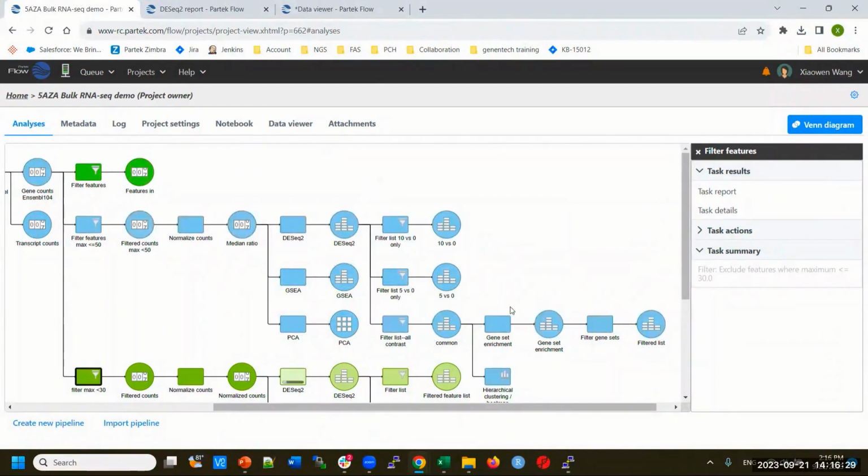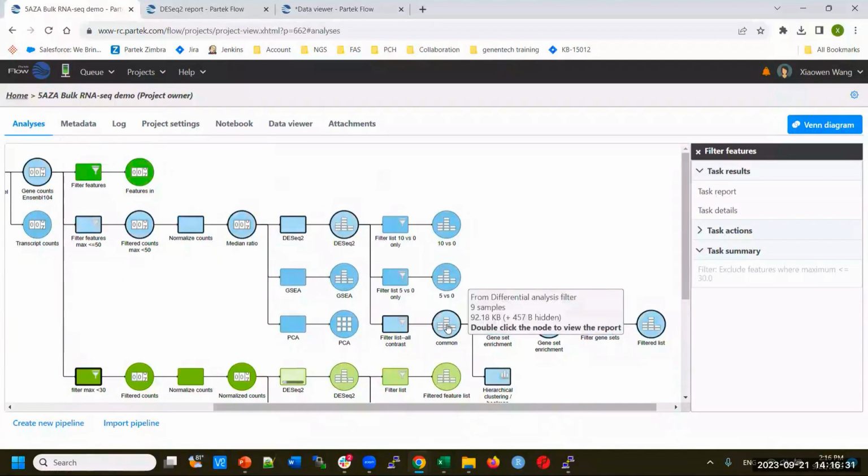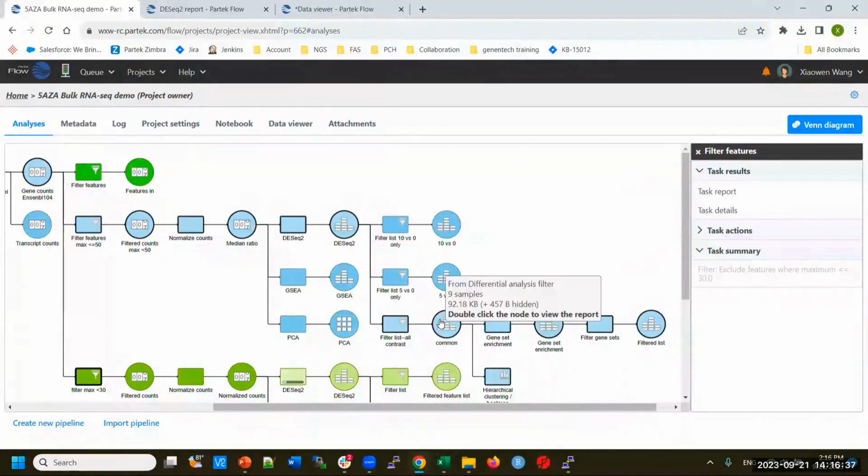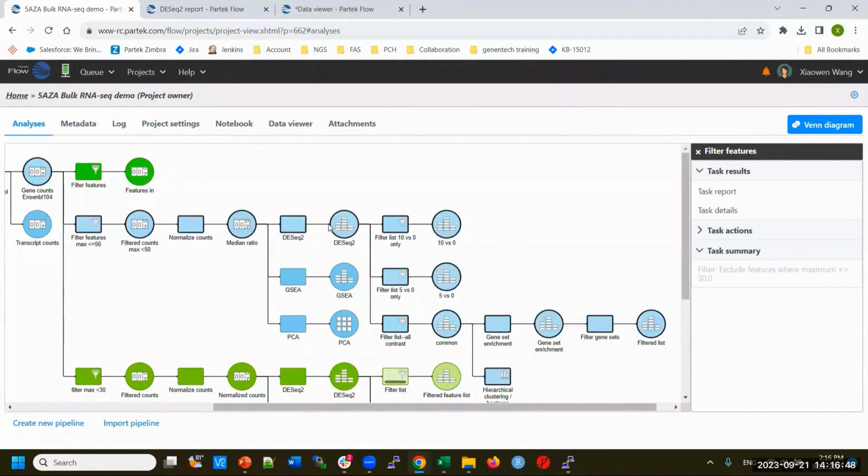And when you get to a data node and mouse over this data node, you will see how we get to this data node: the circle and the rectangle will have a darker border. Like here, they all have a highlight. So you know how you get to here.